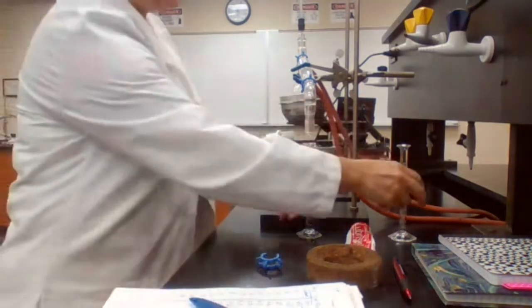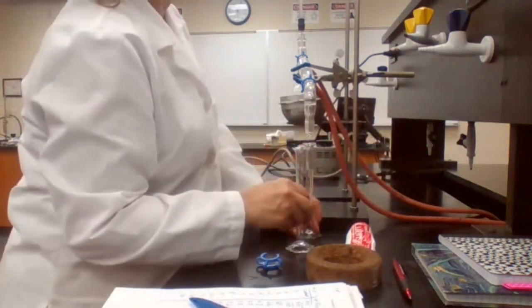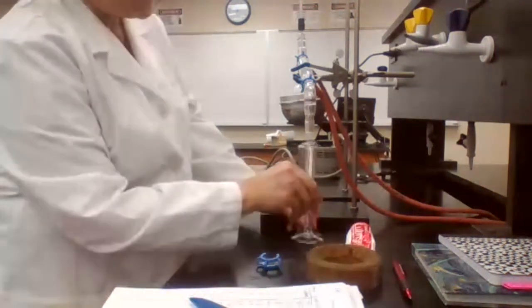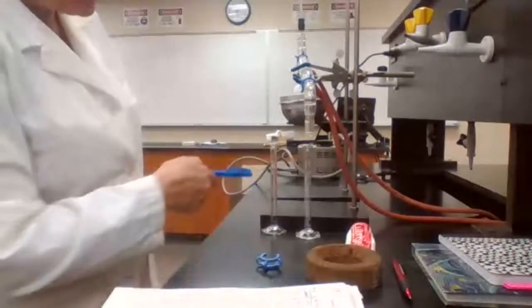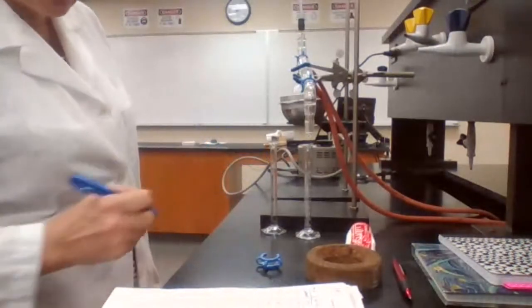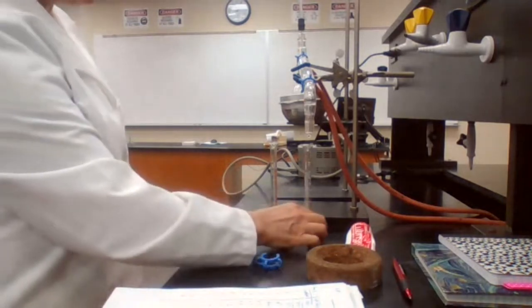Okay, 10 milliliters is 74, and I'm switching the graduated cylinder because after 10 milliliters it is not graduated. 74 for 10 milliliters.